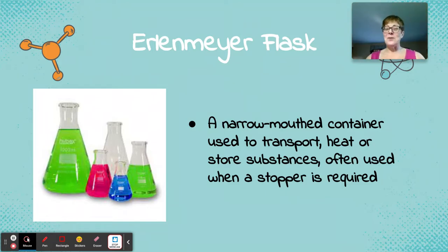It is a narrow-mouthed container, and it's used to transport, heat, or store chemicals. Often, we put a stopper on the top of it. I don't have enough for every group to have one, so we don't generally use these, but I do have them so we can see them and be exposed to them. I like them because of their shape.